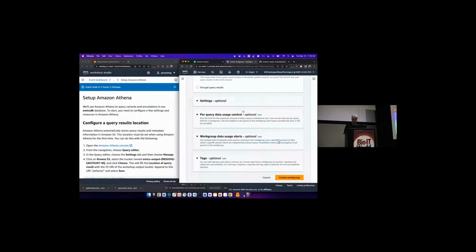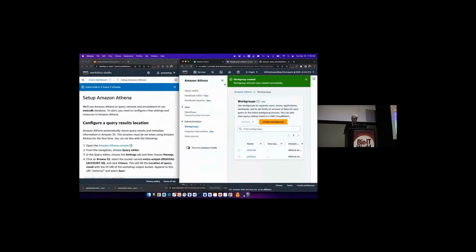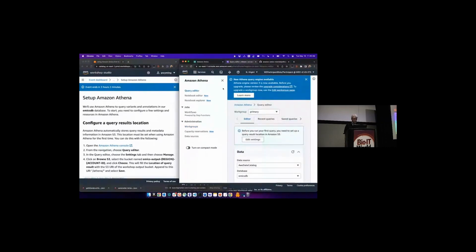All right, I think that's all we need to do. Yeah, that's fine. Okay, so now we can go into the query editor.